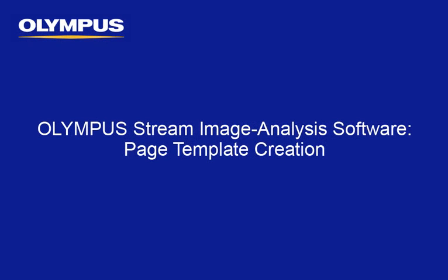This tutorial is one of many instructional videos presented by the Olympus Industrial Equipment Group. This tutorial video will provide you with detailed instructions on generating page templates within the Olympus Stream image analysis software.